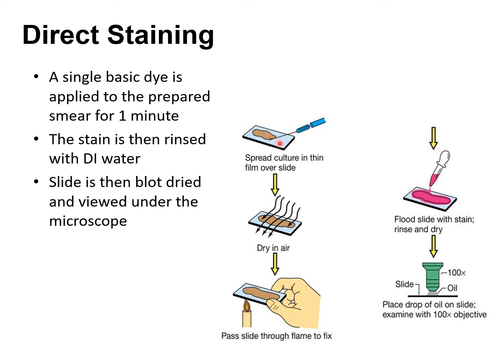This slide has to be clean. Sterilize your loop. Put either a drop of water and then your bacteria, or a drop of broth containing the bacteria already. Make sure that your smear is thin and evened out.